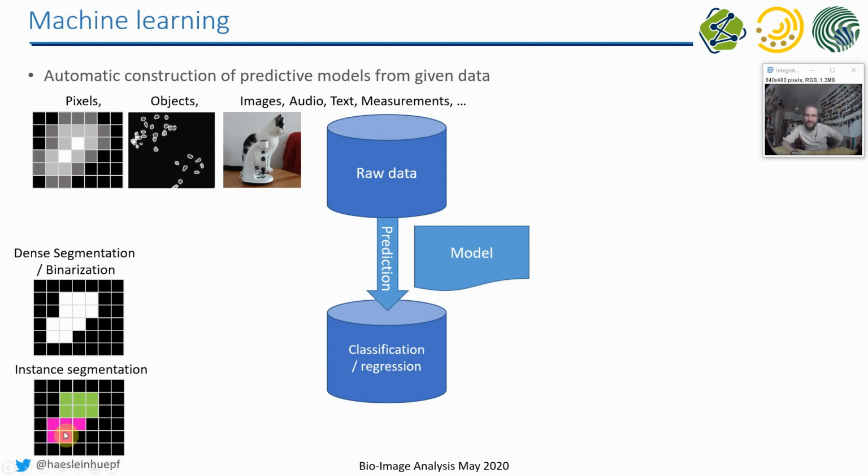So we are segmenting different instances of the same thing. Assume in our original image, we are looking at, at a super bad resolution, two nuclei. So this is two nuclei. And the machine learning algorithm can differentiate both instances of nuclei. That's why it can mark, for example, both in different colors. So that would be an instance segmentation.